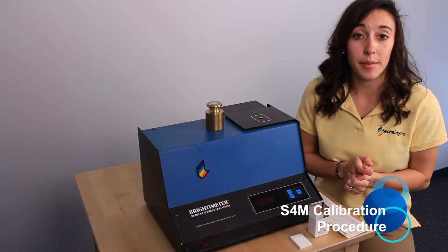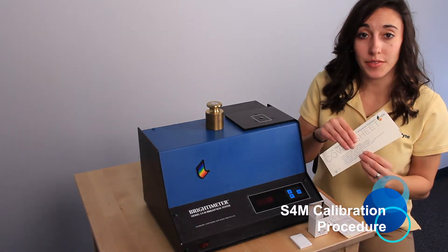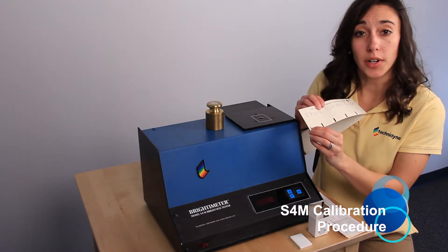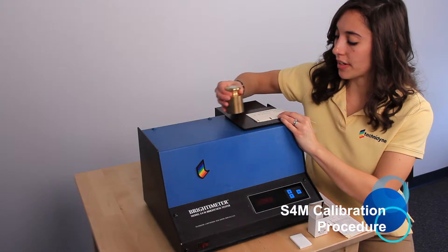For our first step, we'll need our primary standards, which are our 70 standards. You can go ahead and move this front sheet back. We're going to load it so that the dash marks on either side of the one line up with the white lines, and we'll load our one kilogram weight.